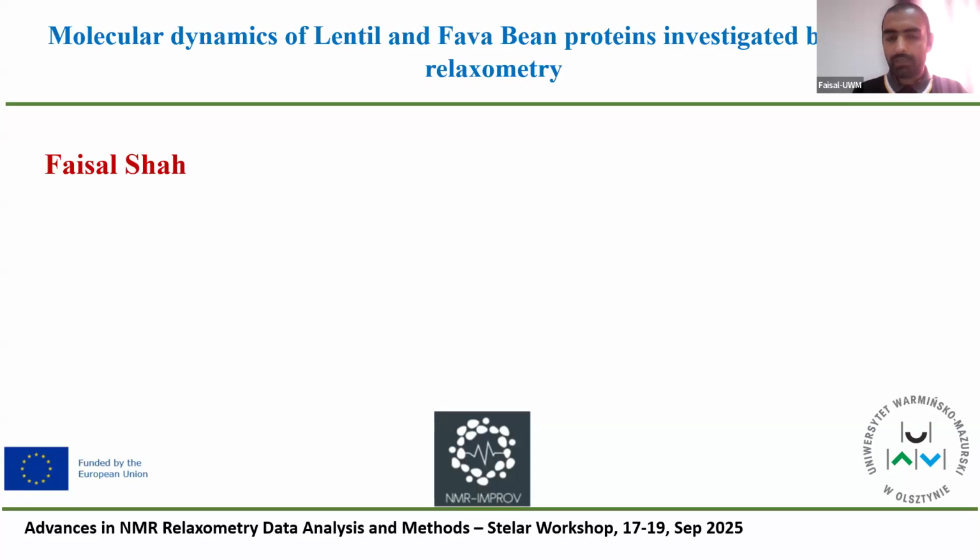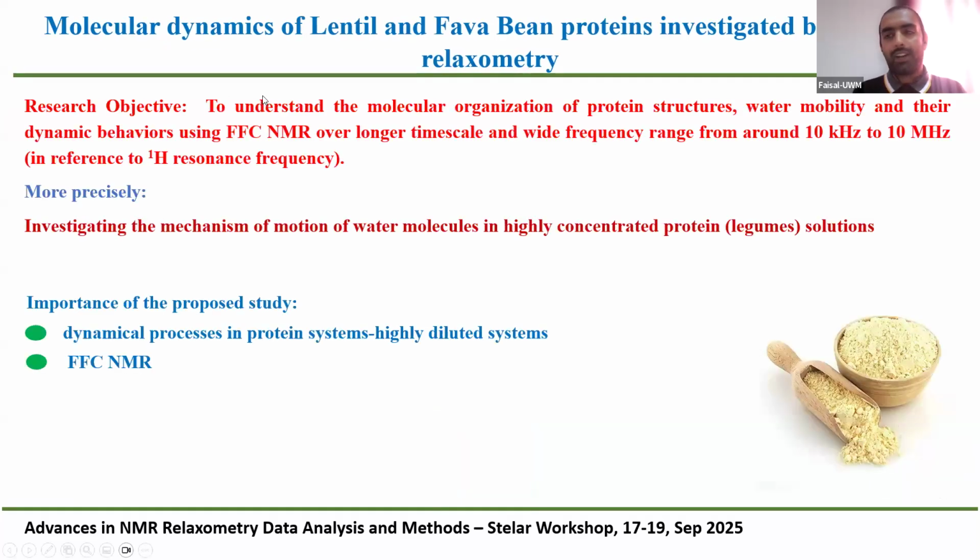So moving towards the objective of this presentation: the objective of this research is to examine the molecular organization of protein structures, the water mobility, and their dynamic behavior using fast field cycling NMR over a longer time scale and wider frequency range. The frequency range that we use in our lab goes from 10 kilohertz to 20 megahertz, but I measured this sample from 10 kilohertz to 10 megahertz in reference to the 1H NMR frequency.